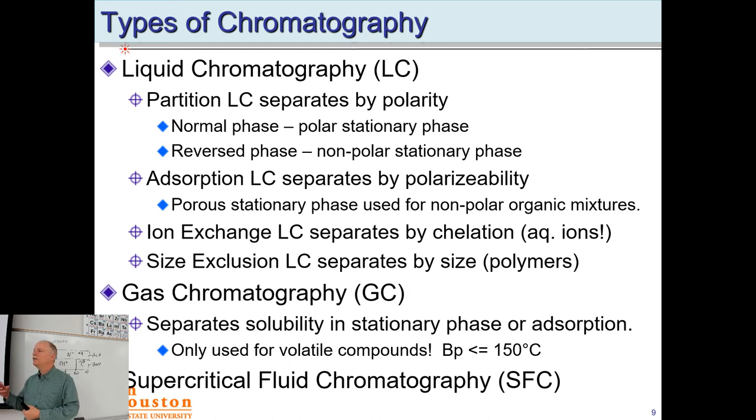That means that the polar molecules are going to come out slower. So if you've got a polar stationary phase, the polar molecules interact and they don't elute as fast as the nonpolar molecules. And reverse is the reverse of that. But if you don't know what normal is, then you don't know what reverse means. Okay. So reverse phase is a nonpolar stationary phase.